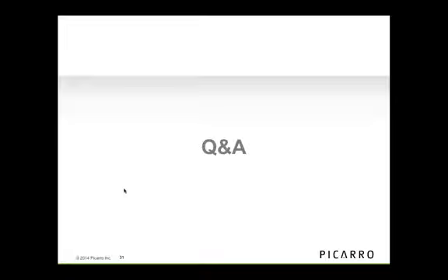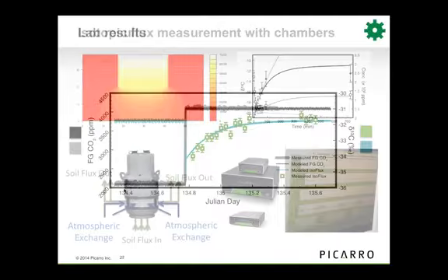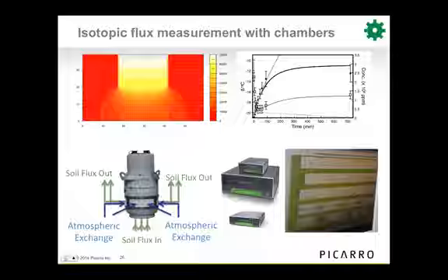Okay, so it's going to be helpful to go back a few slides here, which I'll do. Okay. So the way the chamber actually works is soil flux comes into the bottom of the chamber through just an open bottom into the chamber cavity, and then it diffuses again out across these membranes and into the atmosphere again. And because we know how fast the CO2 can move across that membrane, and we measure the concentration of CO2 inside the chamber, we're able to calculate the flux rate of CO2, so the bulk CO2, and also its isotopologues.